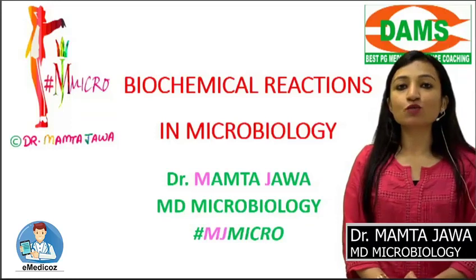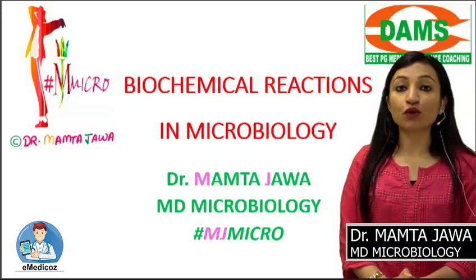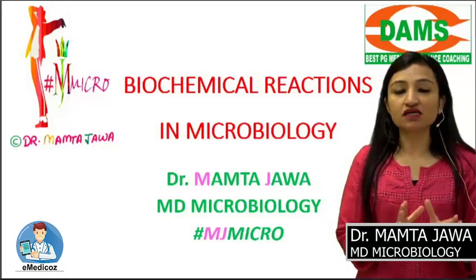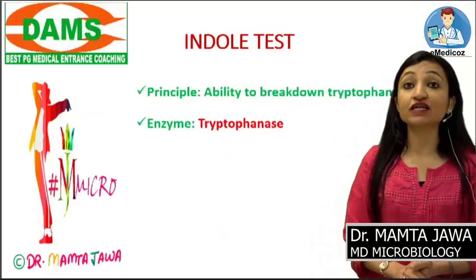Now this video module is going to focus on the biochemical reactions in microbiology, which all of you should know from the point of view of your second prof exams, right? I'm going to take up each biochemical reaction in a separate video, and in this particular video module we're going to focus on the indole test, right?